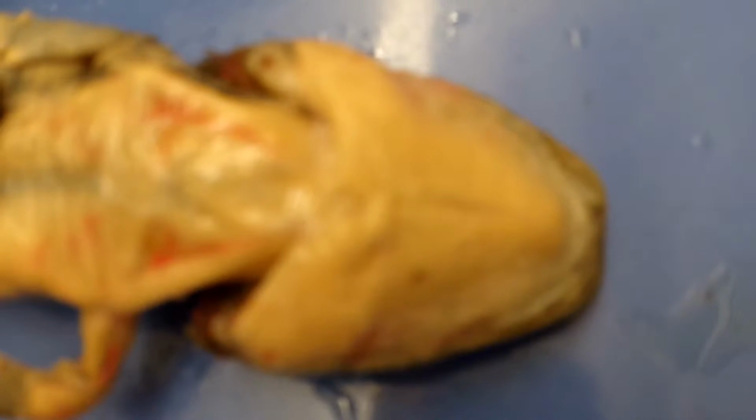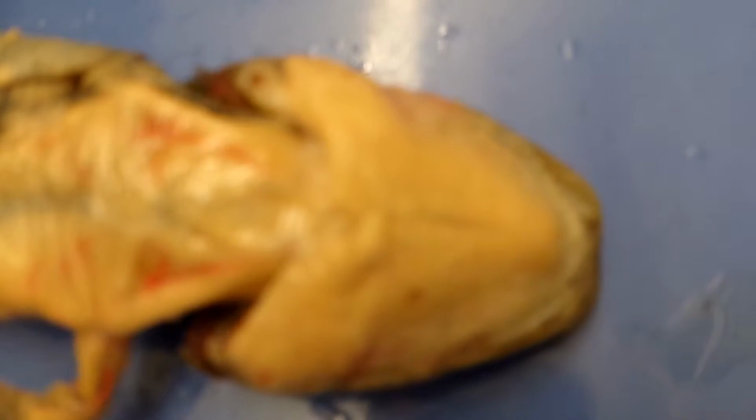The next section of the Necturus is the ventral throat musculature, and the first muscle is the intermandibularis, which is right here. Its origin is the mandible, its insertion is the median raphe, and it's homologous to the intermandibularis of the shark.